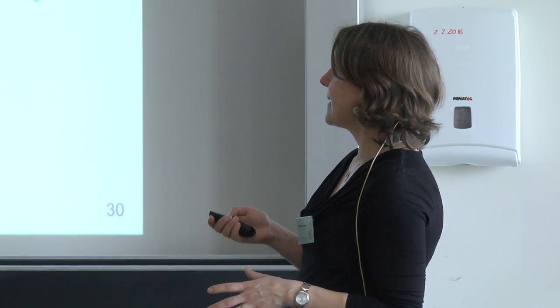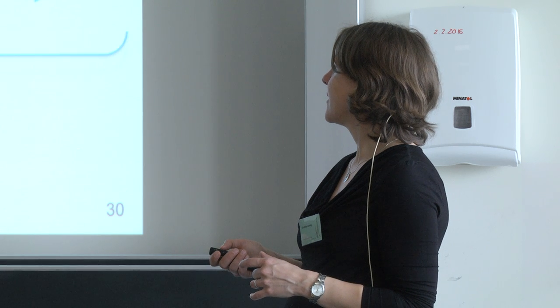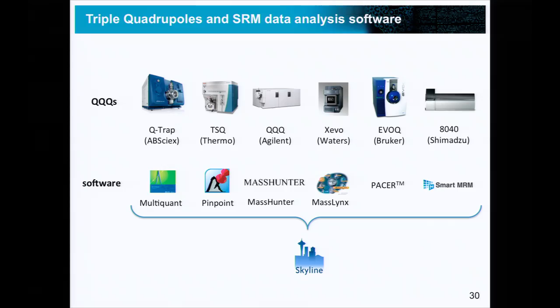So when Brendan started his Skyline project, we were very happy that this project was designed right from the beginning to be able to work with all the different vendors and all the different formats, and to analyze them all with the same software. So you are now the lucky generation that can benefit from having a software that is really able to work with any type of vendor.